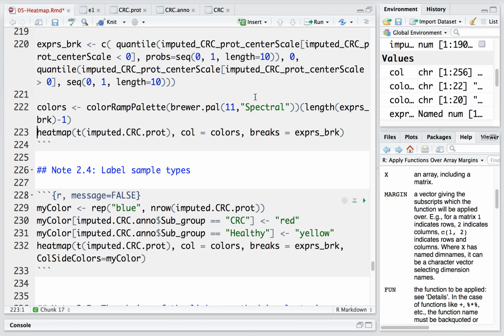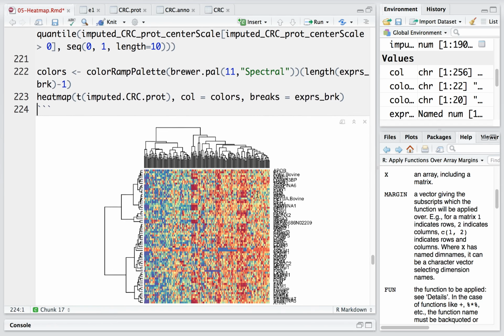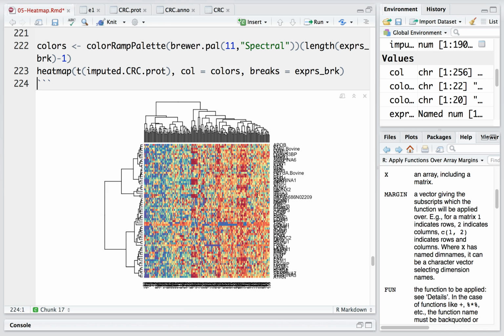Okay, and then we can make the heat map. See, that's the new heat map based on our defined color. Everything here is the same. The data is all the same, the cluster is all the same. We just changed the color. But see, it's much better than our previous first version, the golden color. If you remember, in the previous heat map it was hard to see some clusters just from the color. But here, actually, we can see there seem to be two groups, the left side and the right side.